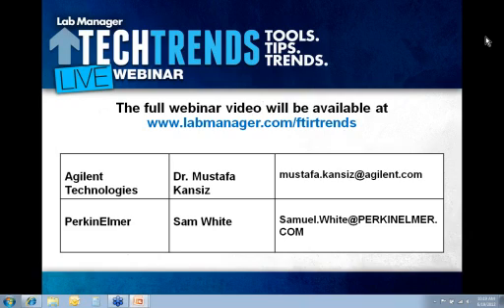I don't think you'll find anybody that will say that near-infrared is the only way to do that. Historically, it can be done. It really comes down to sample load. How many samples a day are you going to run? Because near-infrared has the advantage of working through glass. You don't have to remove samples from a glass vial. The problem with near-infrared, if there is one, is it's not particularly diagnostic.